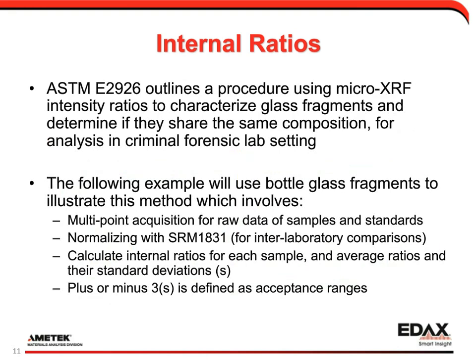Okay, so that is the general idea. The quantitative routine of using internal ratios has been in XRF software for quite a bit, but the actual procedure now outlining how to use these intensity ratios to specifically characterize these glass fragments, and also to determine if they share the same composition or not, comes from the ASTM method E2926.